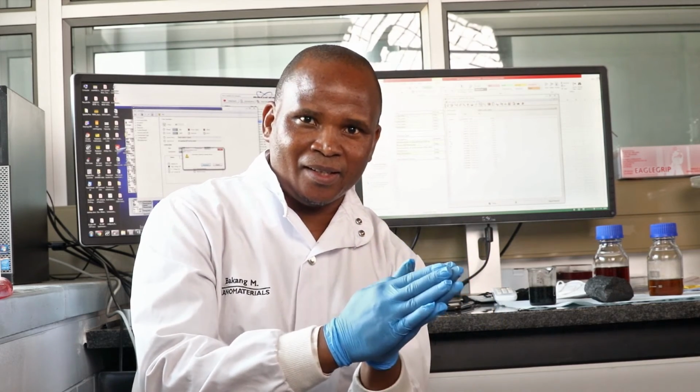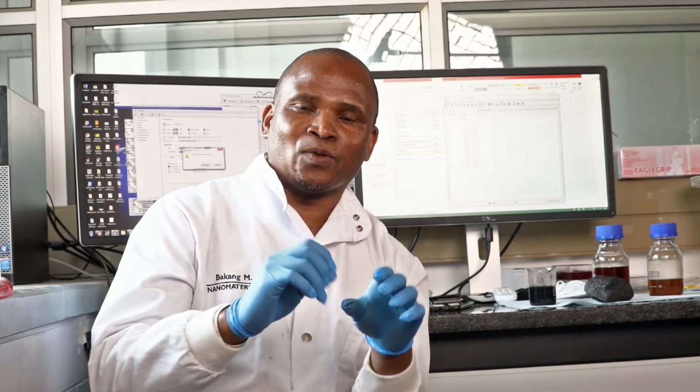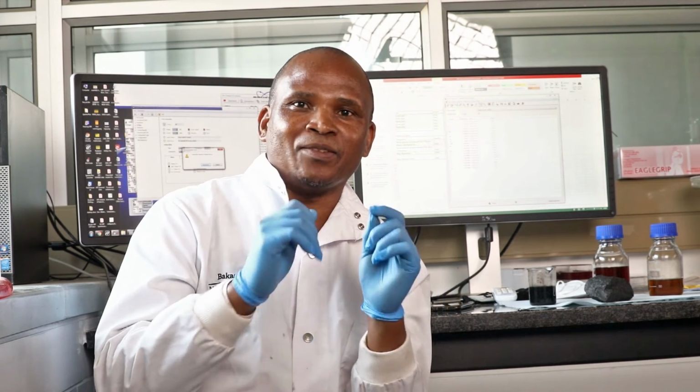But because I know the elemental composition, I can use that information and transfer it into the XRD. Because these two materials have different crystal structures, the XRD reveals to me, since I know they are carbon composition materials, that these two structures are different by their patterns, and therefore I can confirm that indeed this is graphite and that is diamond.